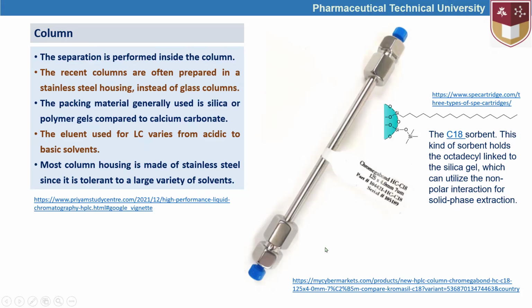That's why, if we want to provide acidic conditions, they should be weakly acidic. In some cases, acids like phosphoric acid are used, but not sulfuric or hydrochloric acid.